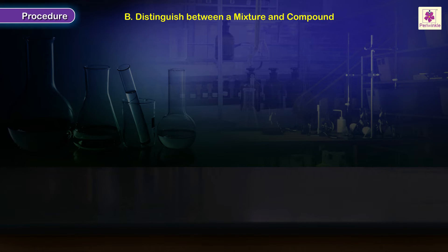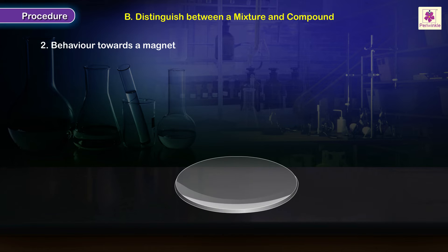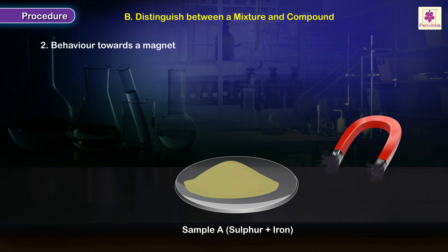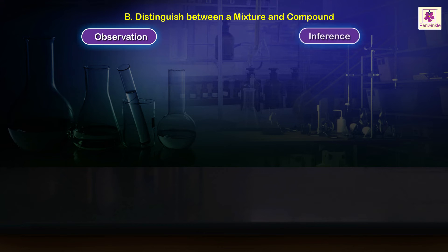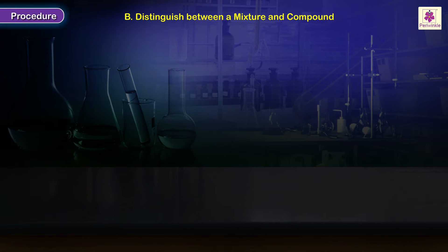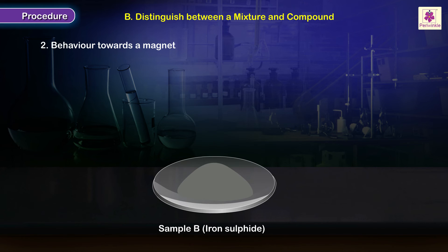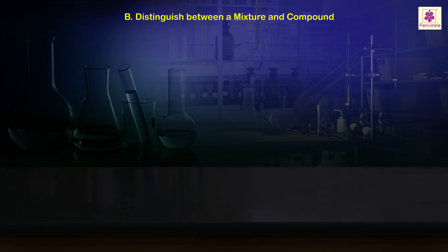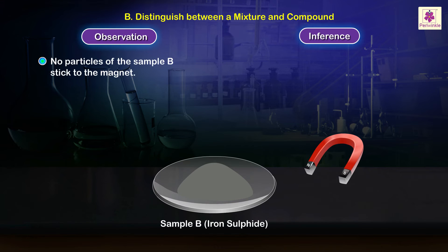Procedure to distinguish between a mixture and compound on the basis of behavior towards a magnet: place a spoonful of Sample A on a watch glass and slowly move a magnet through the mixture. Observation: iron filings stick to the poles of the magnet — iron in the mixture retains its magnetic property. Place a spoonful of Sample B on a watch glass and slowly move the magnet through the powder. Observation: no particles of Sample B stick to the magnet — iron in the compound has lost its magnetic property.